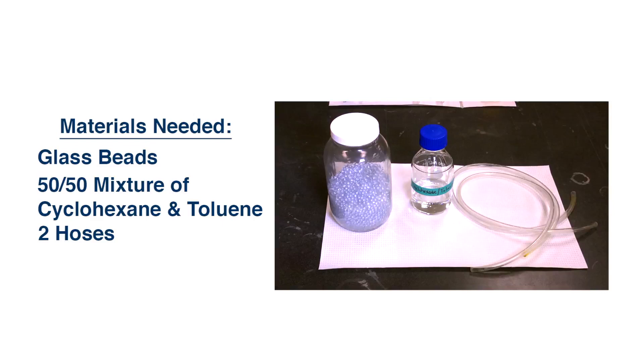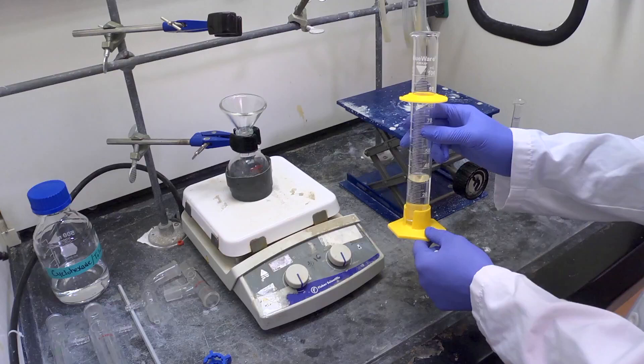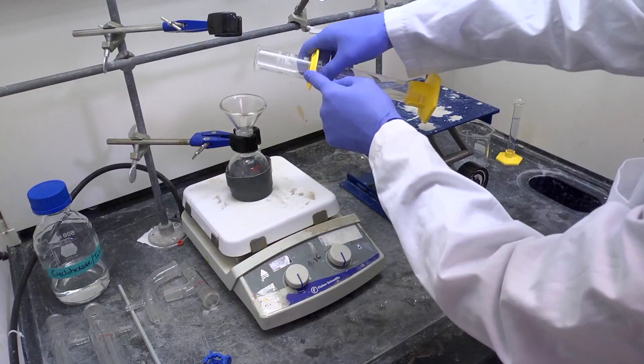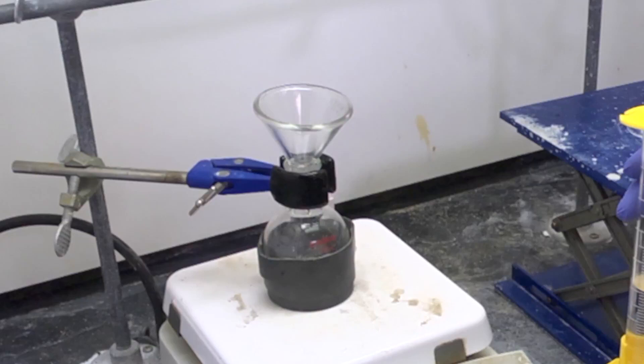You will also need glass beads, a 50-50 mixture of cyclohexane and toluene, and two hoses. Begin by adding 30 milliliters of your 50-50 mixture of cyclohexane and toluene to your 100 milliliter round bottom flask. Add a stir bar. This is known as your distilling flask.